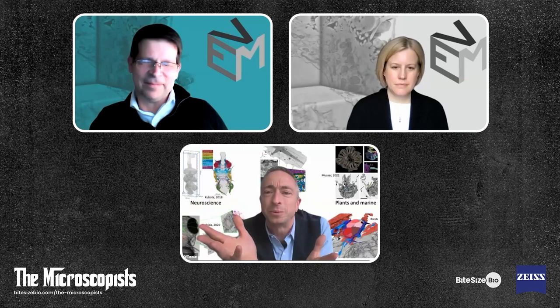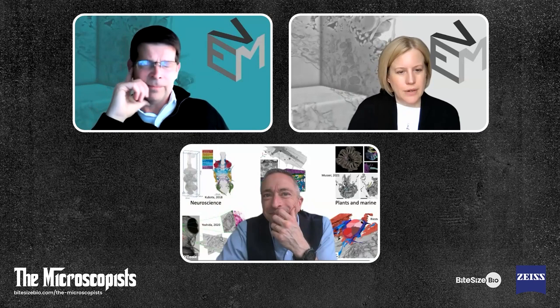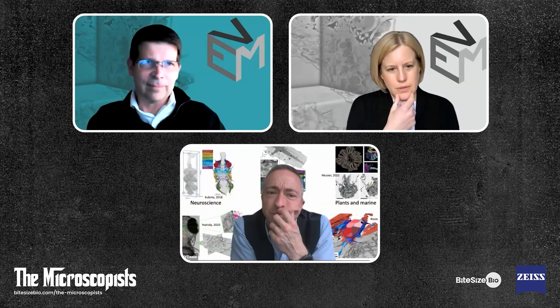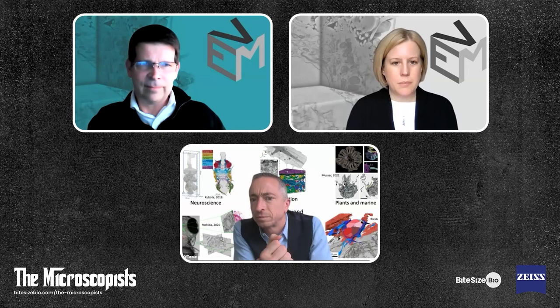So Lucy, you finished on talking about neuroscience. What sort of samples are you generally looking at yourself? Oh, could be anything. So we use volume EM for most of our projects now because, as we say, life happens in 3D. The image on the bottom left there is from a collaboration with Eva Frickel's lab and Serge Mostowy. That's on zebrafish and looking at toxoplasma in the zebrafish brain and trying to localize it as the fish mounts an immune response, to see if you can use a zebrafish as a model for disease states, because they're much easier to image. You can get a lot more of them than you could with a mouse model.